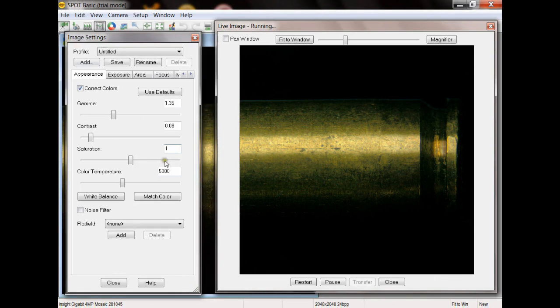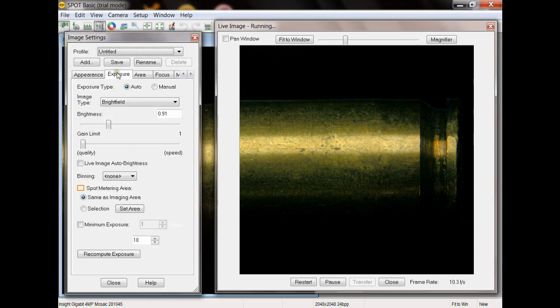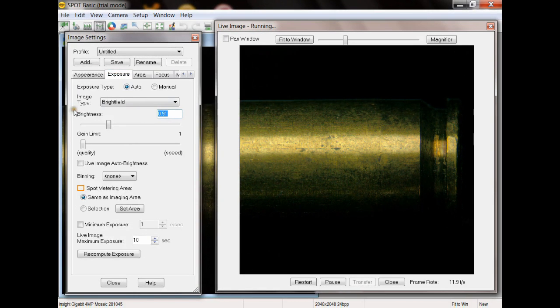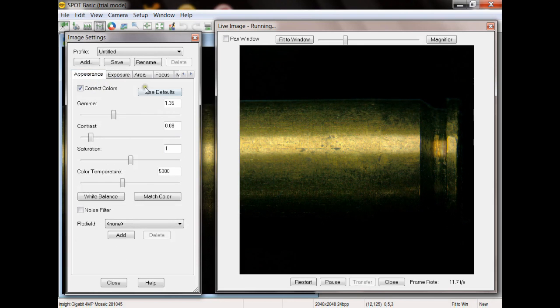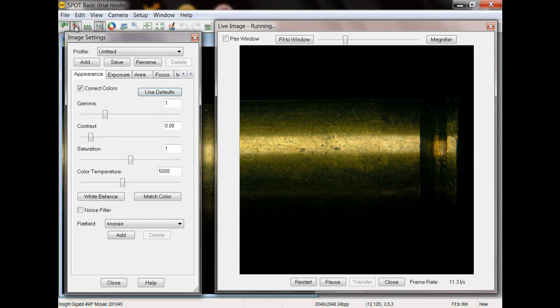So for comparison let's take a look at the standard. So let's go back to 1.0 and let's use the default for our gamma. So let's take a picture.